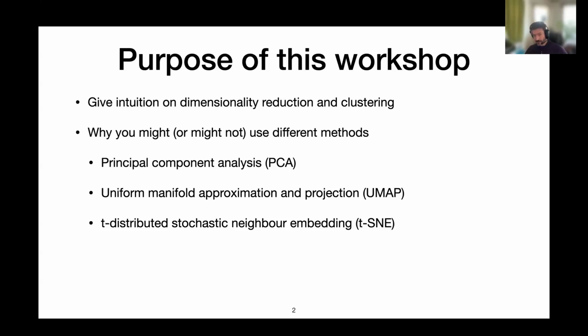The latter two methods are quite closely related, and they're very common these days in human genomic work, but especially in single cell work. And I'm sure if you've read those papers, you've probably seen these types of embeddings.